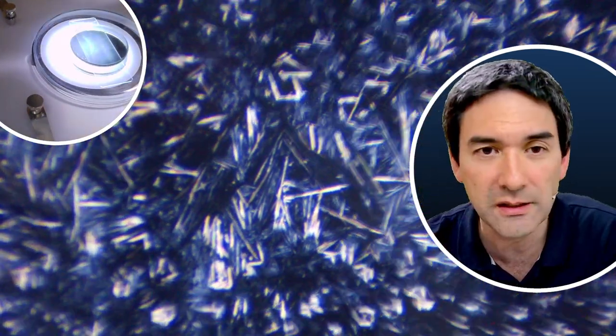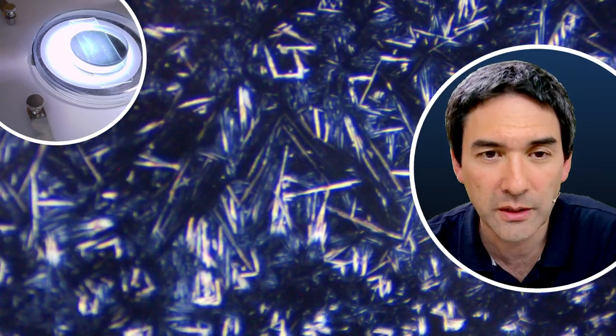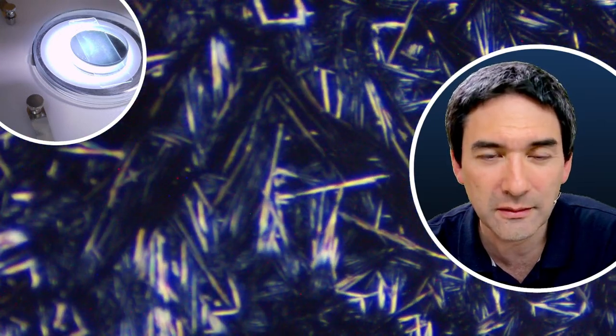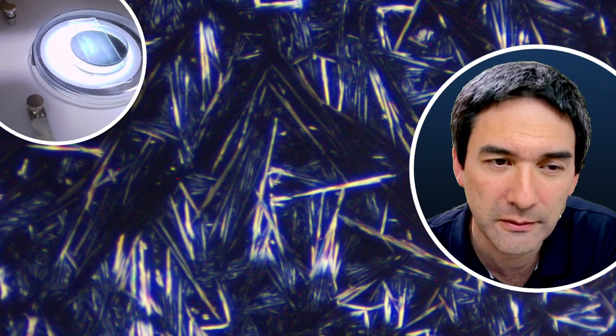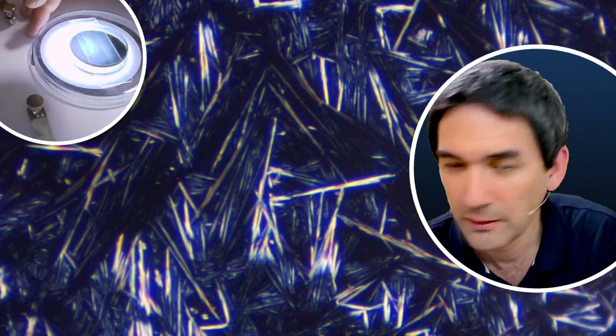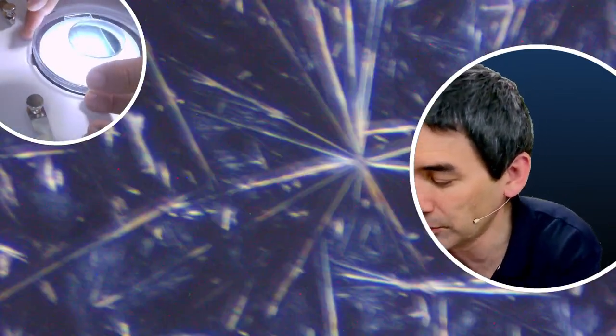So we can zoom in a little bit. And you know what, I'm just going to show it to you also on my compound microscope. So this is now 55 times magnified. See, that's a little bit the problem here. I don't know how to move the whole thing. That's nice.